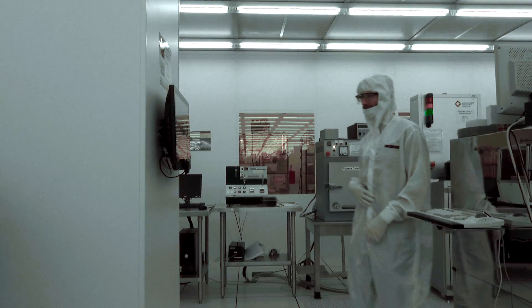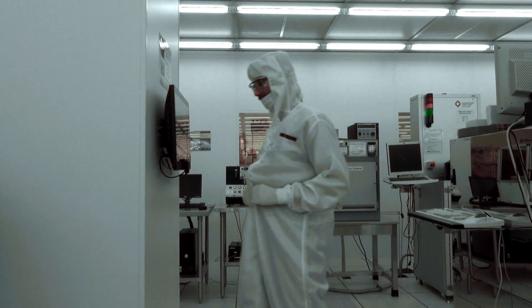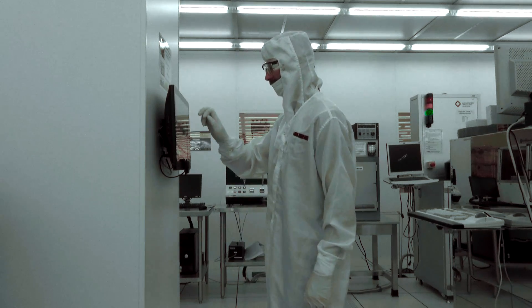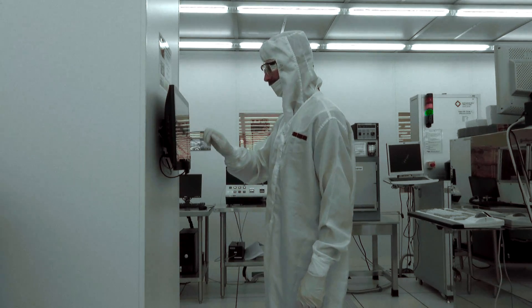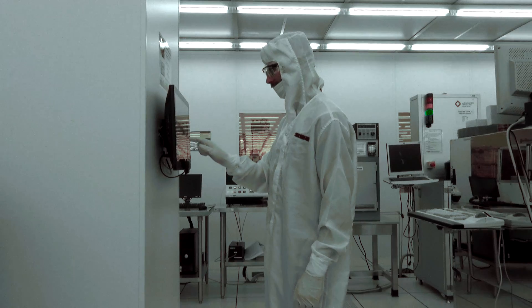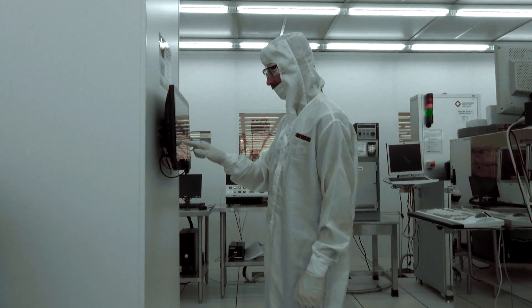Before you can begin using the Denton Explorer, you must first log into the system at the access controller. Once you have done this, you may begin operation.